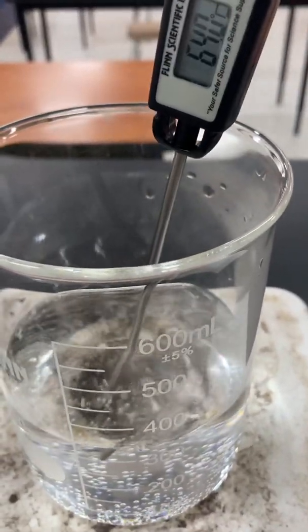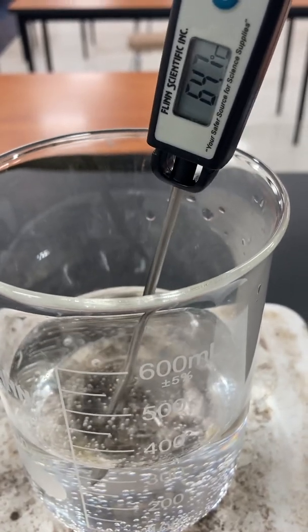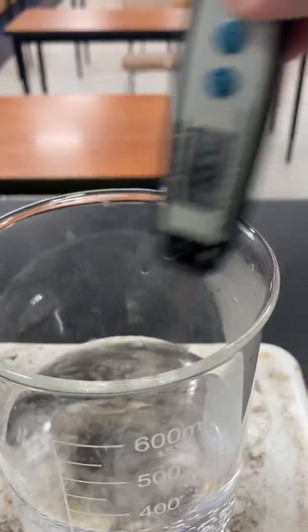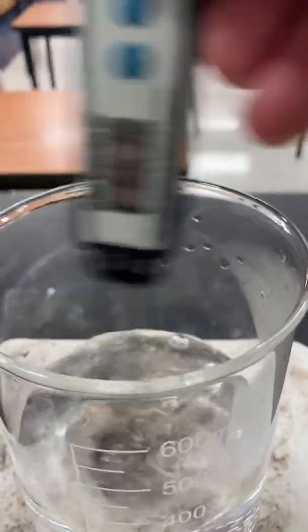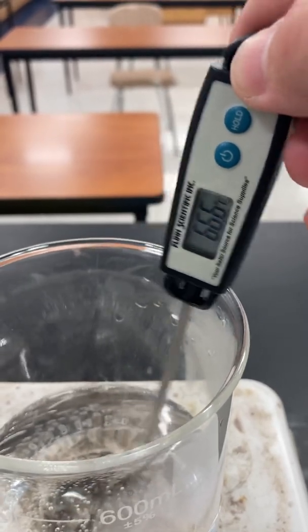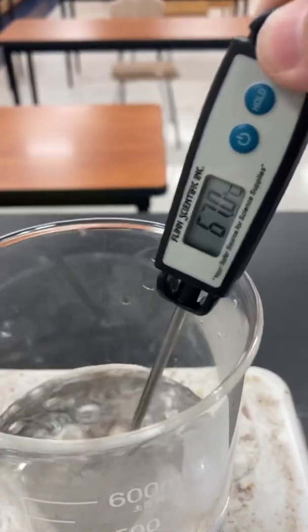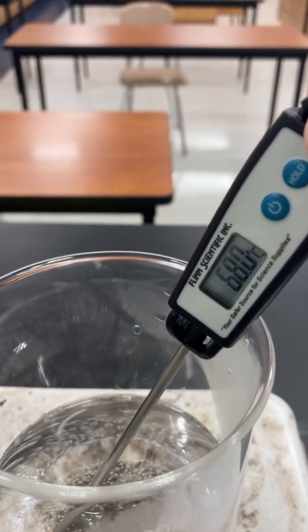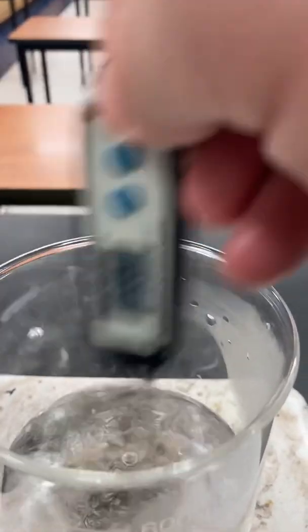What's happening to the molecules inside of this beaker right now, those molecules of water? What's happening to them right now? What are they starting to do? Okay, at 8:30, we're at 67.8 degrees Celsius.